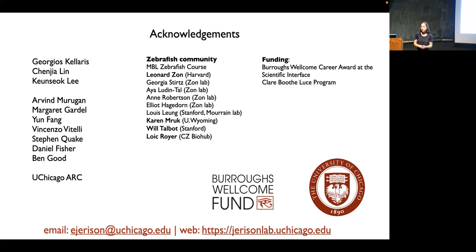We don't have precise quantitative characterizations for them yet, but that's really what we hope to do. Are you talking about using lasers to actually drive the immune system, moderate it? Yes. Sort of like Star Trek. Yes. Well, I don't know that laser driven interventions would be that useful clinically. We're interested in using it very much as a discovery, as an experimental tool to be able to controllably drive the system and learn what it does.